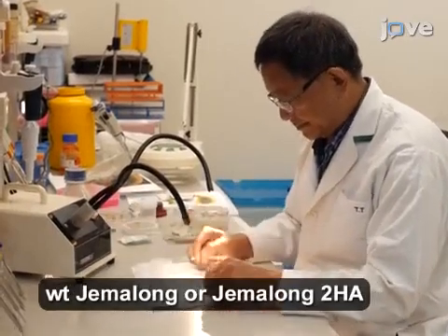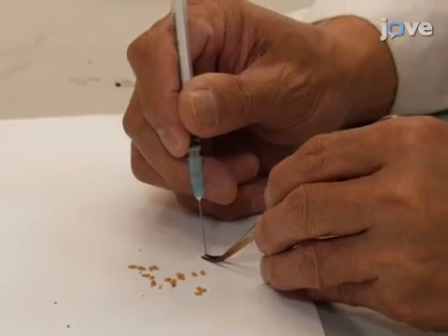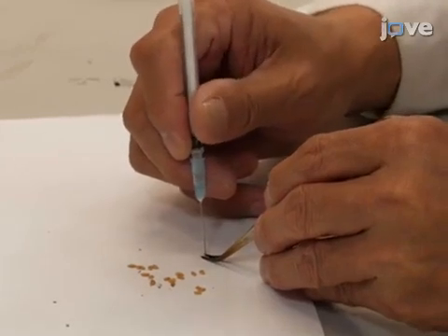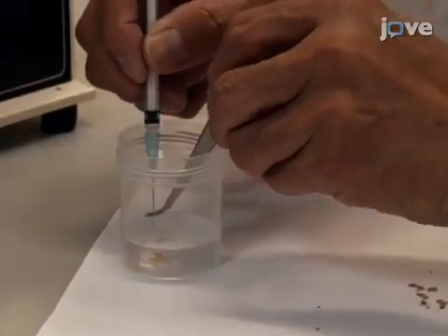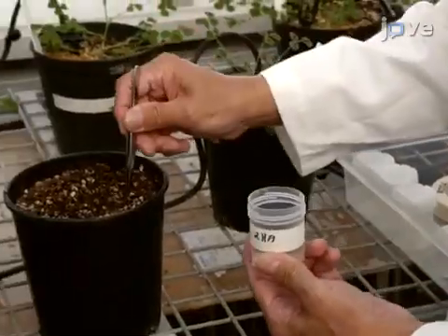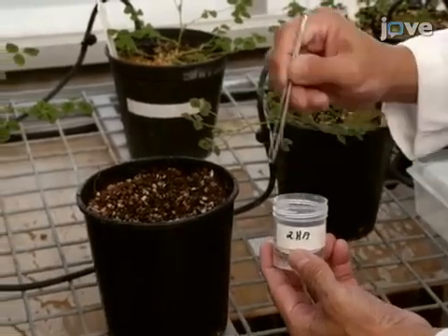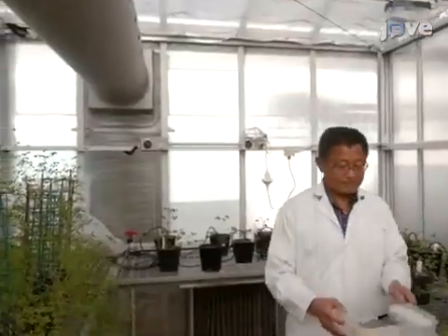To facilitate zygotic embryo development, pierce the surface of the seed coats of seeds from a Medicago truncatula plant and soak the seeds overnight, fully covered in water. The next day, sow three seeds in each of 10 fifteen-centimeter diameter pots in potting mixture and transfer the pots to a glass house.